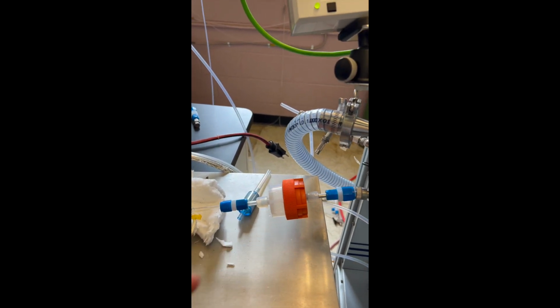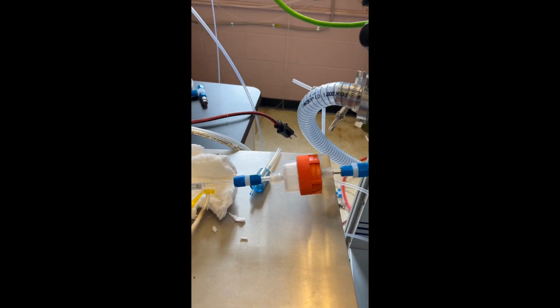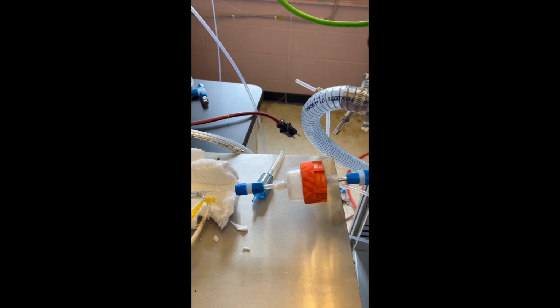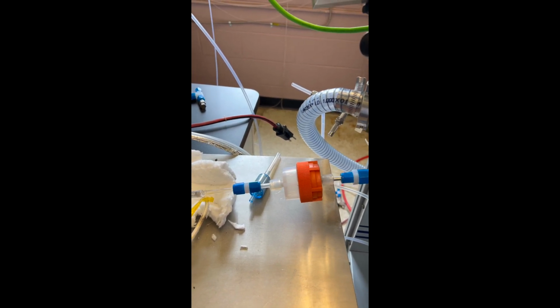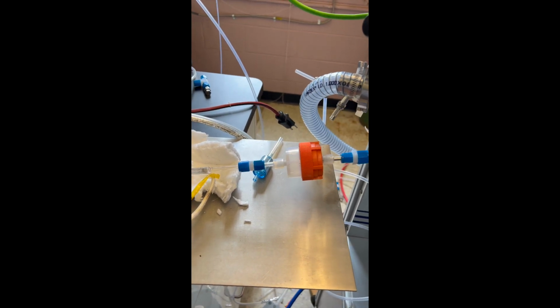Inside this filter holder, we have the filter, which had been collecting PFAS, or Philadelphia air, for around 2 weeks at a flow rate of 5.2 liters per minute. So our goal is that this hot nitrogen carrier gas is volatilizing the PFAS once it hits the sample.